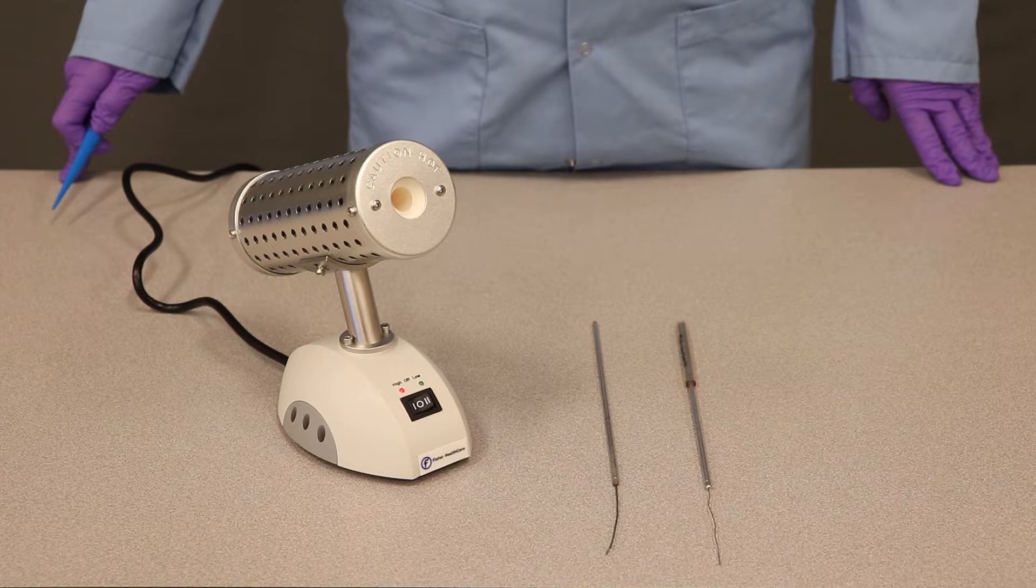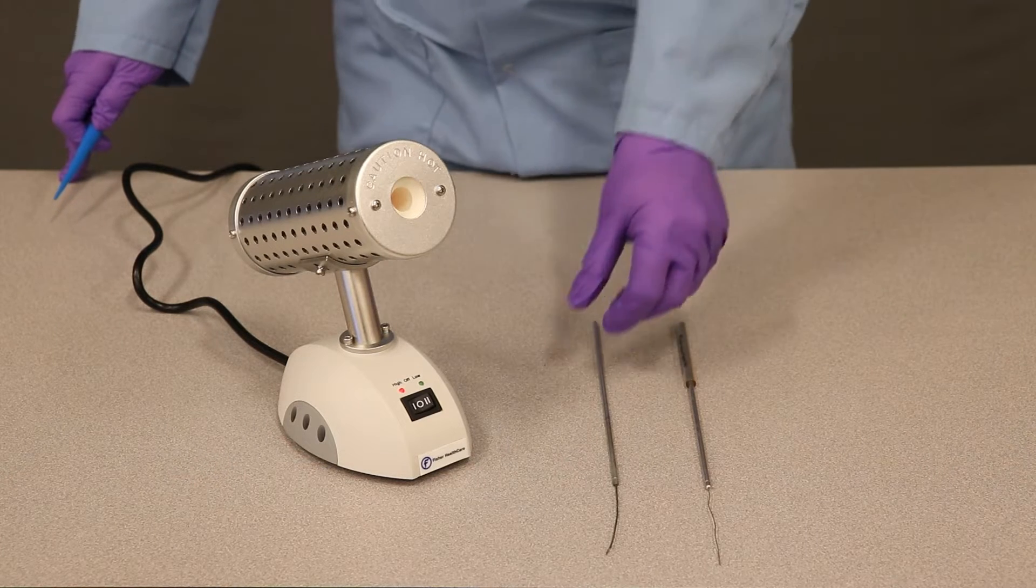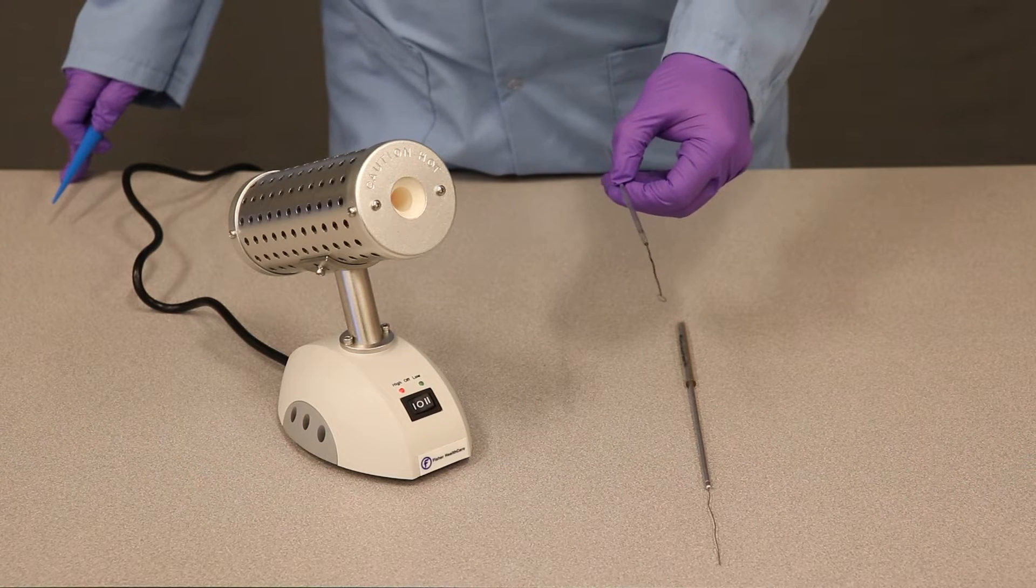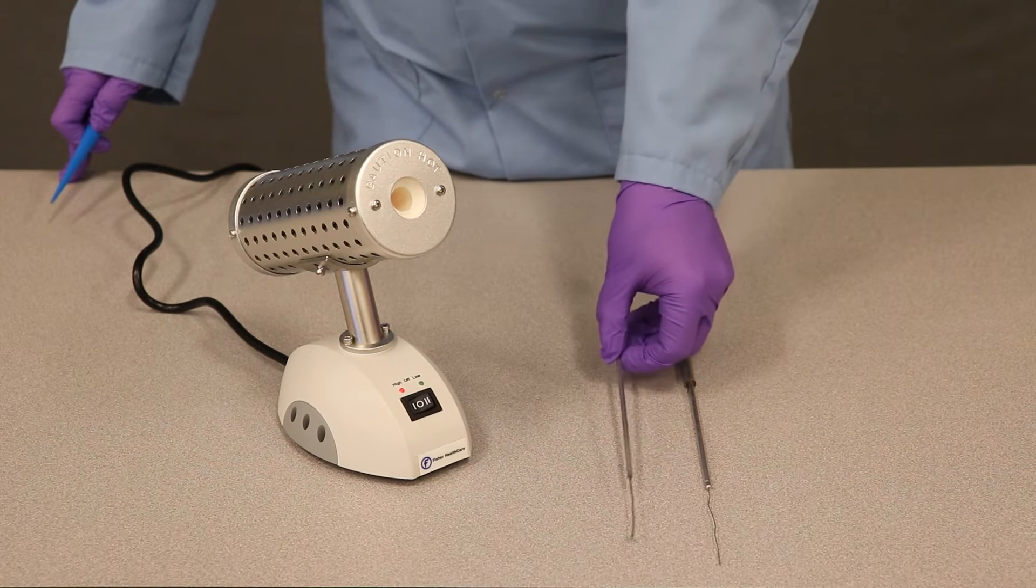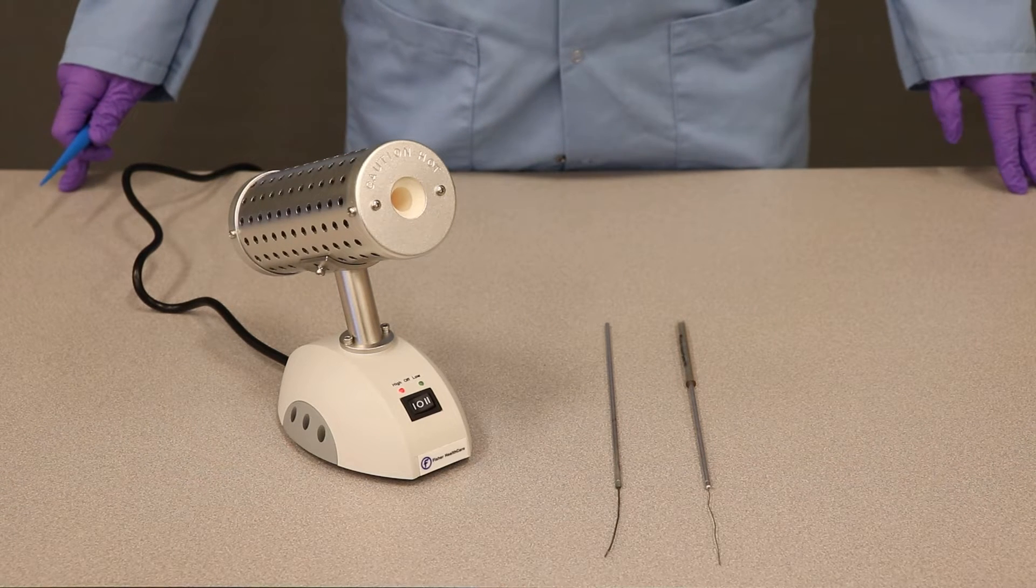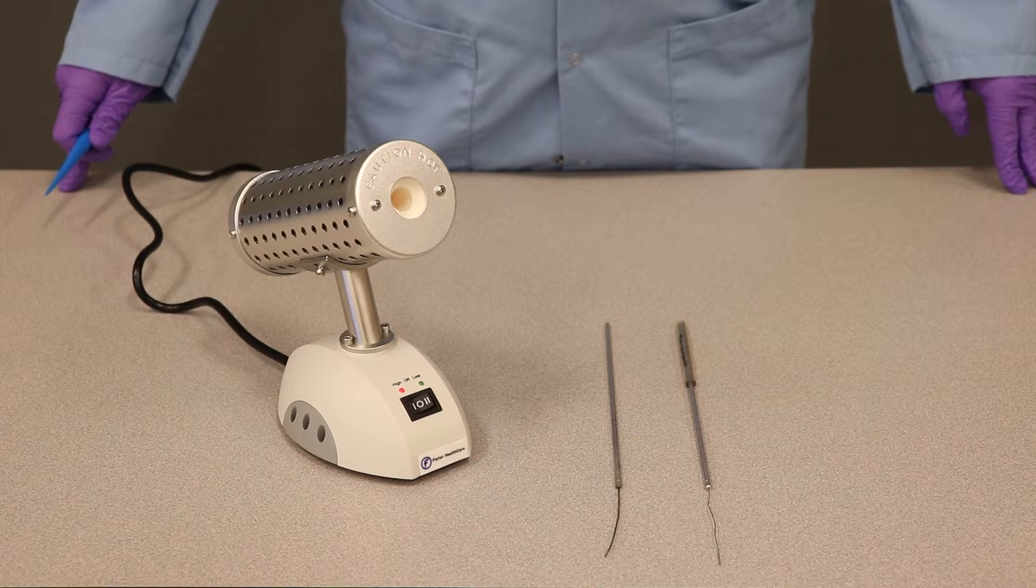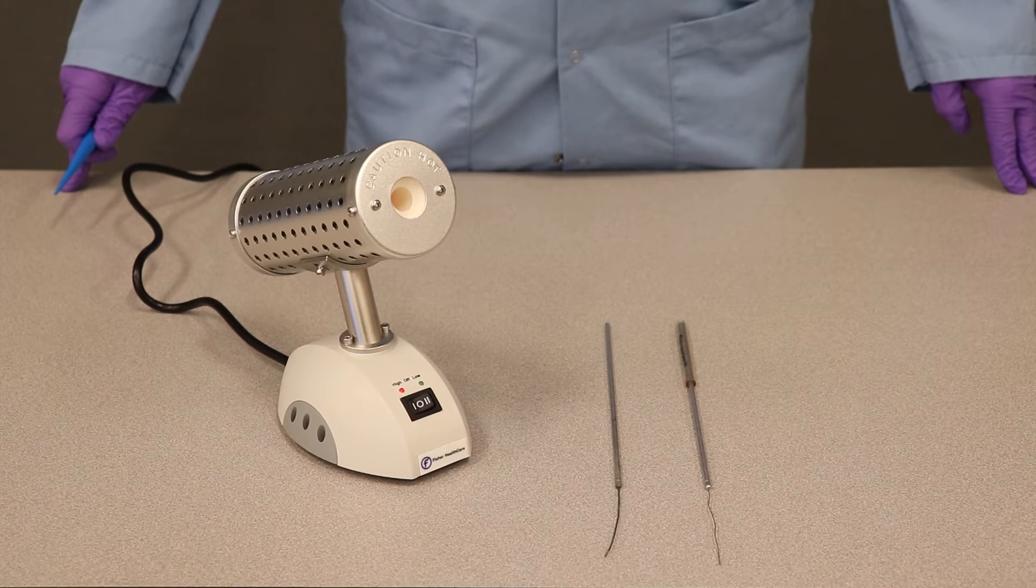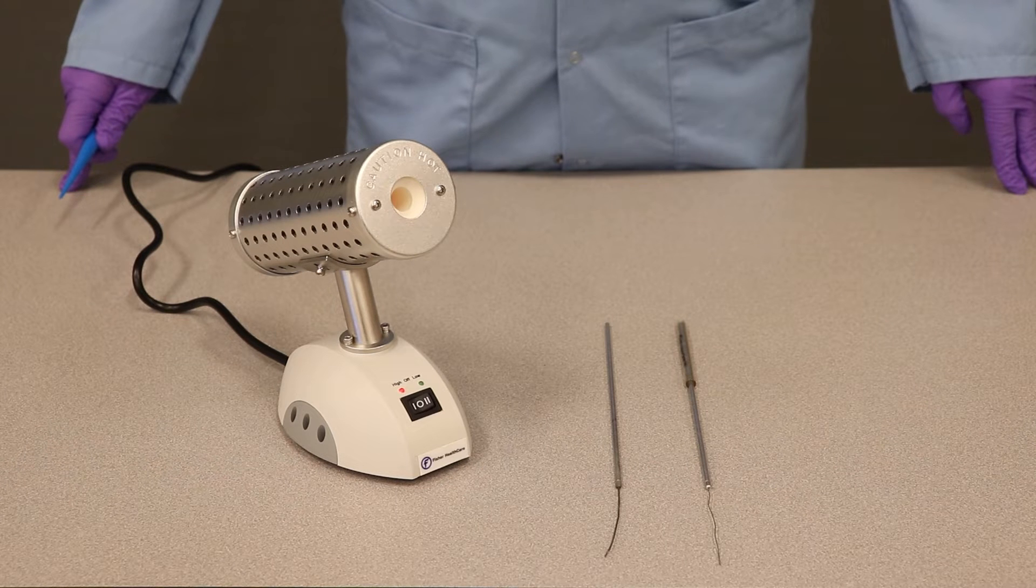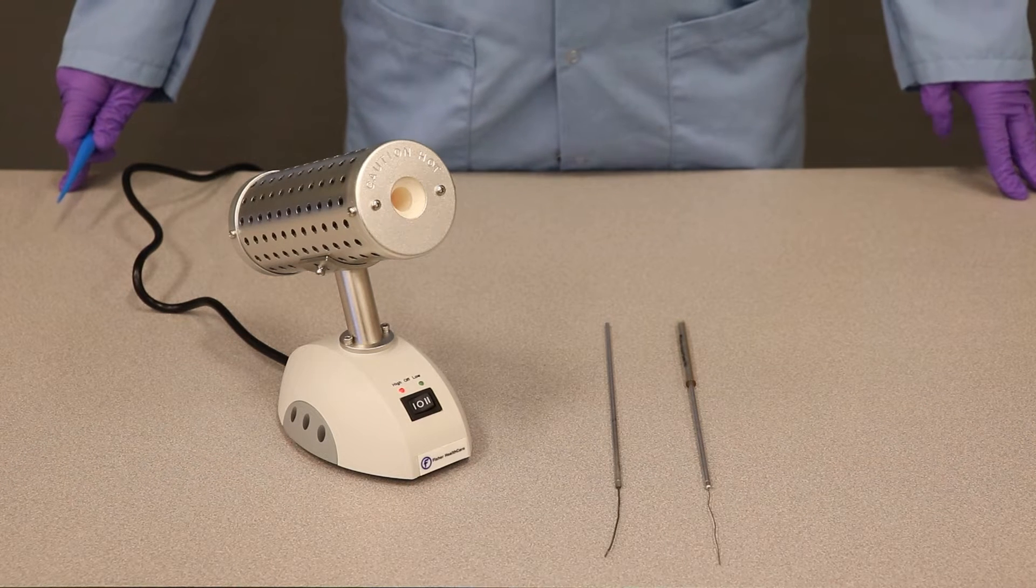Bact incinerators are a tool we can use to sterilize loops and needles for microbiological inoculations. We use Bact incinerators in cases where we cannot use a Bunsen burner, like in rooms where there are no gas outlets, or inside biosafety cabinets where the airflow would knock out the flame of a Bunsen burner.